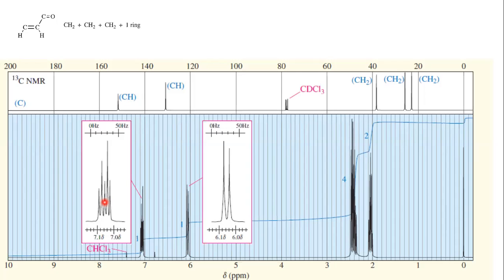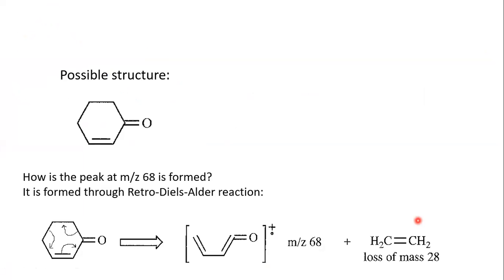So based on all these data, we can say that this is a molecule with this type of bonding, and it has 1, 2, 3 CH2s, and then it also has these 1 and 2 CHs, and also a carbonyl. The carbonyl is bonded in a manner that gives this conjugation. So step by step, solving this puzzle, ultimately we come to this compound.